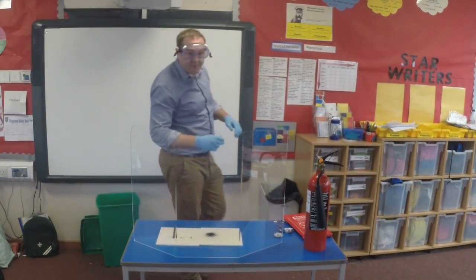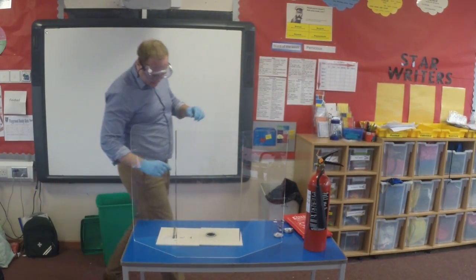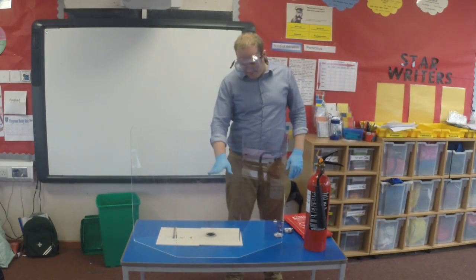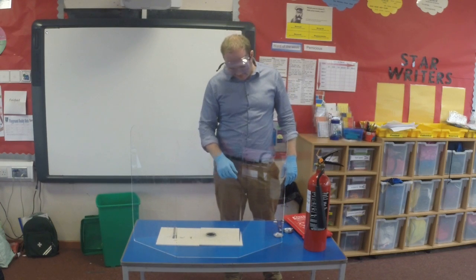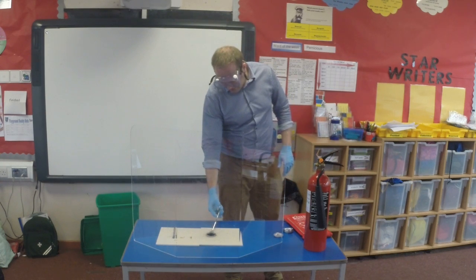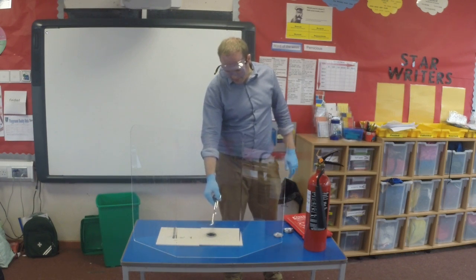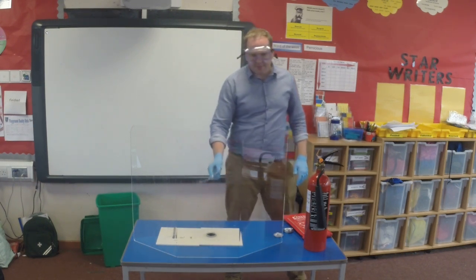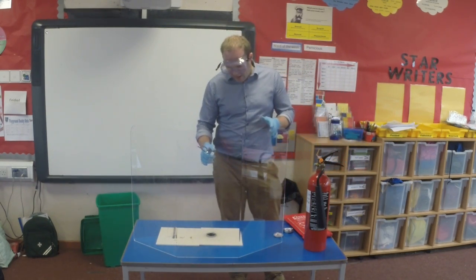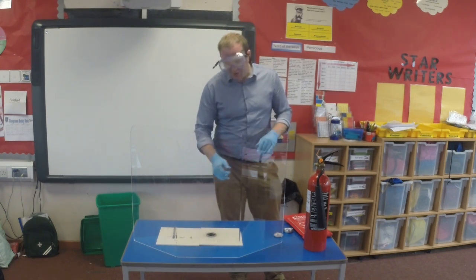Now this burns with a very high heat, so that's probably the most important thing to bear in mind right from the start. It's very, very hot, so I would not be touching this for quite a while. That needs to cool down quite significantly. When I do decide to touch it again, I need to be positive that the reaction has finished. So I'm going to, using a spatula or some other metal implement, mix up the chemicals, stand back from it again, and let anything else react that might be waiting to react.